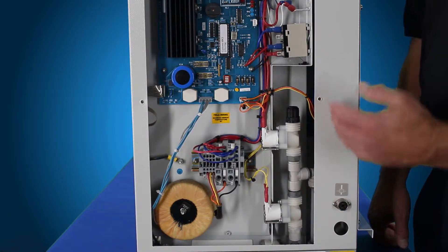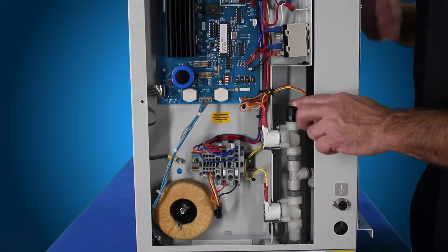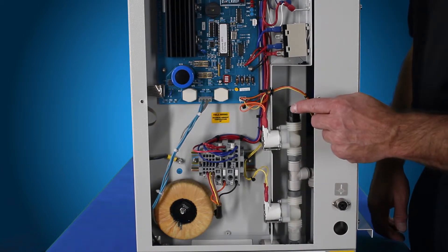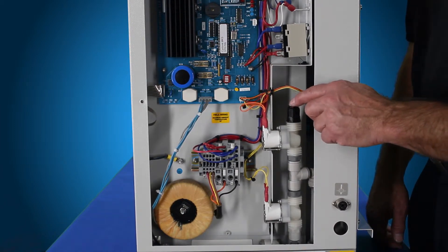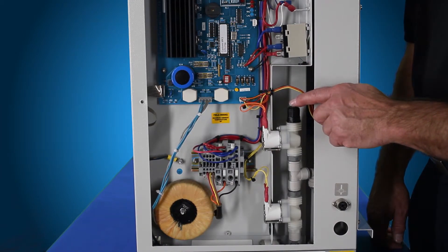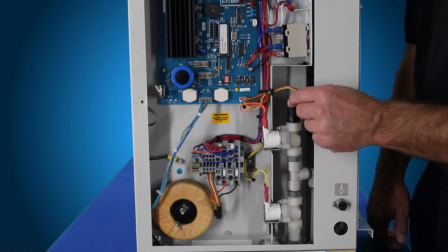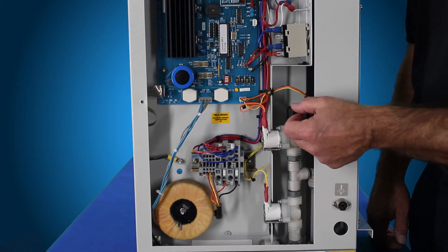Now that we have the right side panel removed, I've disconnected our outlet to our condensers. For the 8 liter and the bi-distiller, there's going to be just a piece of rigid tubing coming out of here that goes to the very back. For the 4 liter, there's a disconnect here that has blue silicone tubing connected up to it. You just remove that from there with the John Guest fitting.